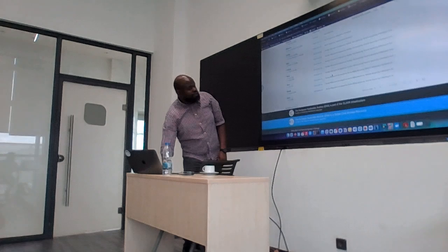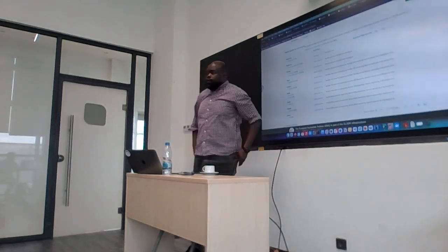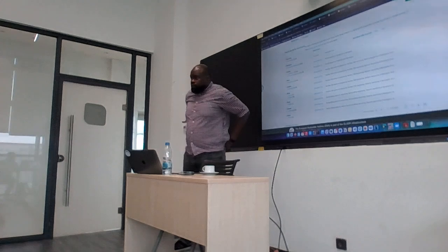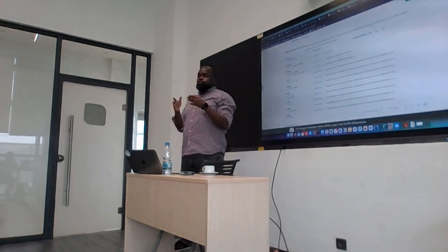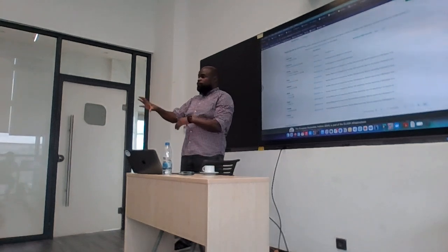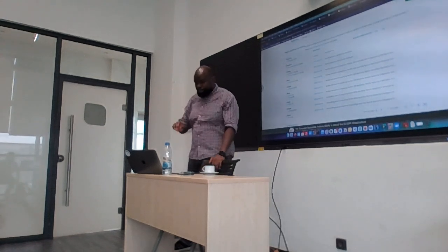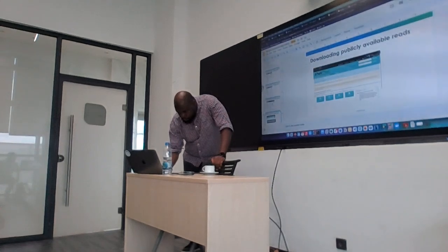See, you can get a list of all the sequence data, whether they are Oxford Nanopore or Illumina, etc. So this is if you want to run a background data set that is fastq in addition to your own data set. Okay? Good.